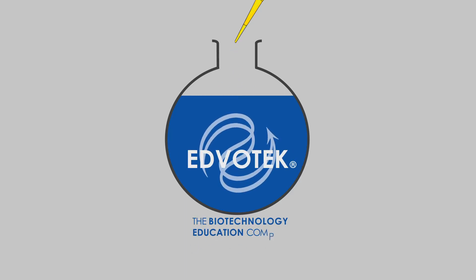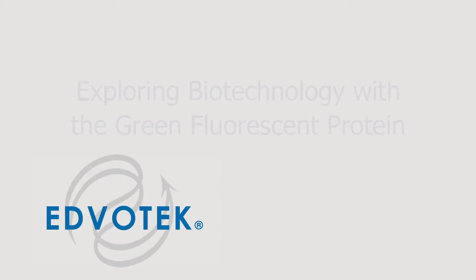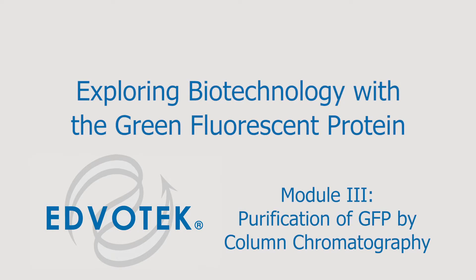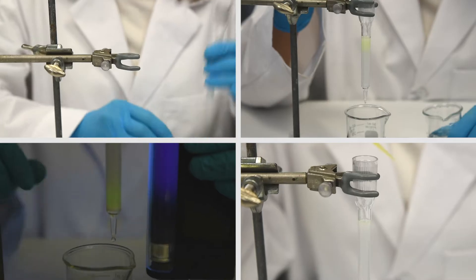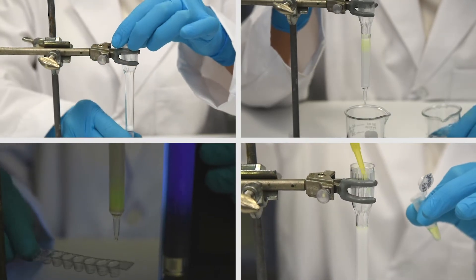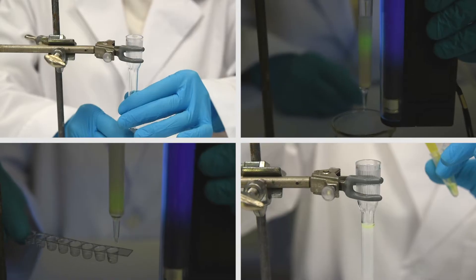Edvotek Instructional Videos presents Exploring Biotechnology with the Green Fluorescent Protein Module 3: Purification of GFP by Column Chromatography. In Module 3, the GFP containing cellular lysate from Module 2 will be purified by column chromatography.